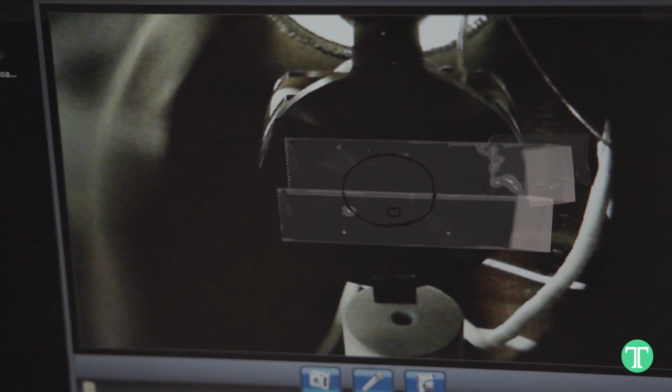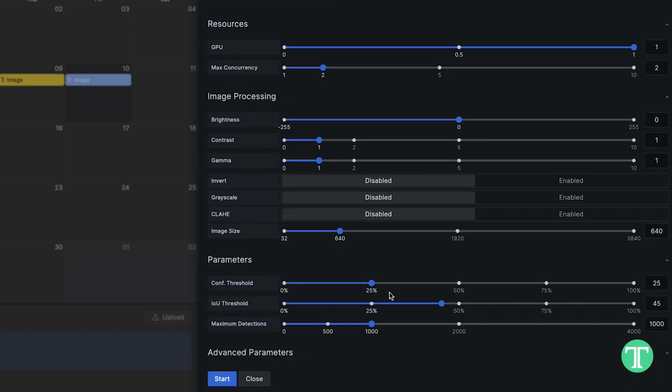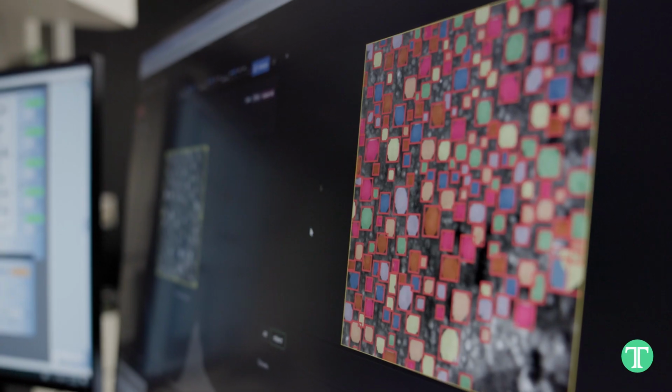I've been working with annotating visual data, mostly helium bubbles, so I draw circles around every single helium bubble I see. There's hundreds of bubbles on every picture. I've spent hours upon hours doing that. Theiascope can just identify them way faster than I could. It saved us so much time and energy.